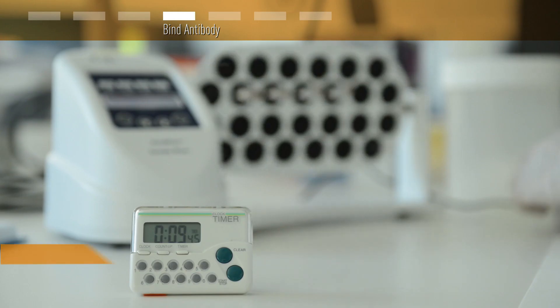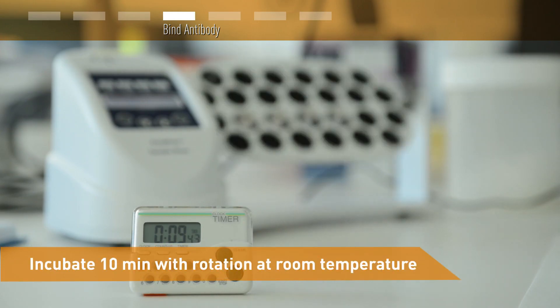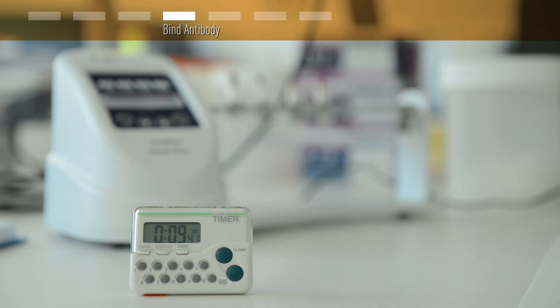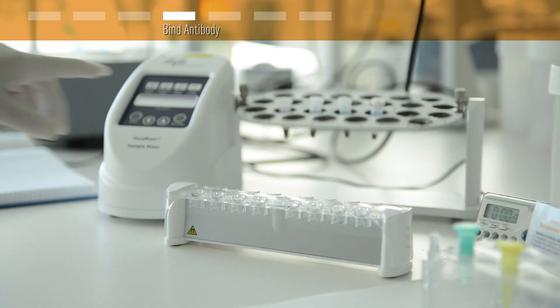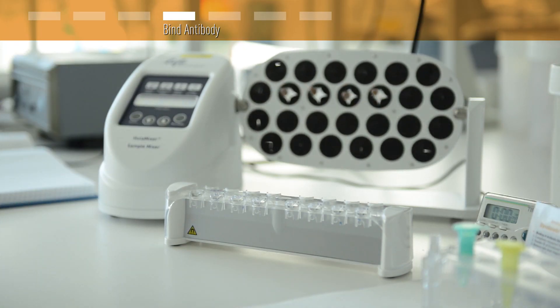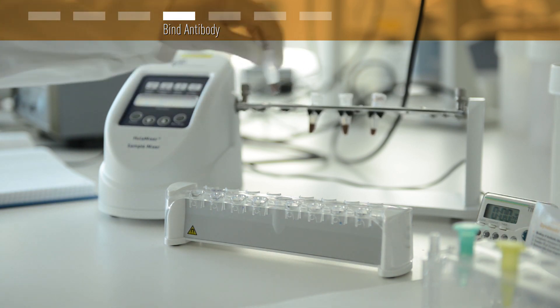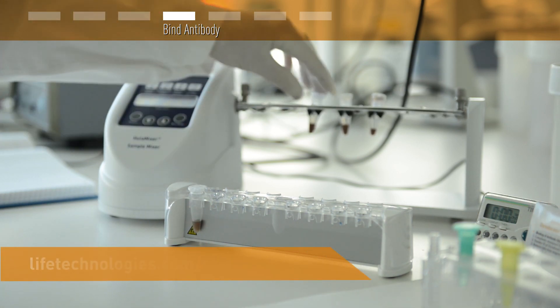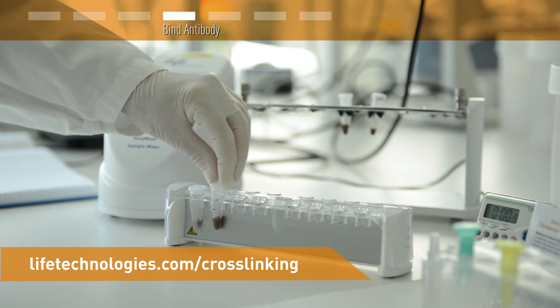During a short incubation, the antibody binds to the bead surface via their FC region. To avoid coelution along with your target protein later on, you can cross-link the antibody to the beads before you add the sample. You'll find a detailed protocol on the web.